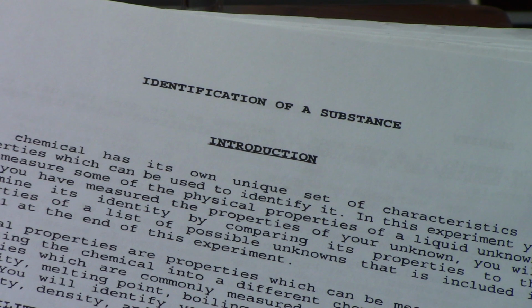What I'm going to do is I'm going to do 3 tests and compare my 3 tests against some knowns that have had the same 3 tests done and see if I can figure out what my unknown is. Okay, so the first test will be something called solubility.